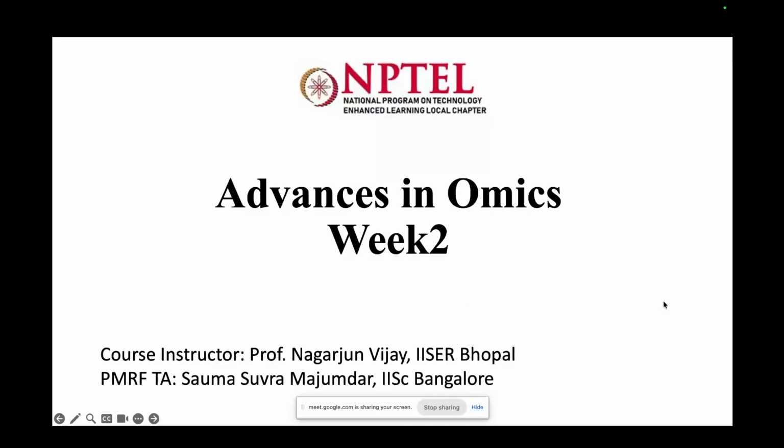Okay, welcome to week two of Advances in Omics. Today's session will be a little bit repetitive with respect to the first one because we'll be discussing pyrosequencing again, mostly, and other small sequencing techniques. A lot of you were asking me in the last session to discuss a little bit about how to do the data analysis.